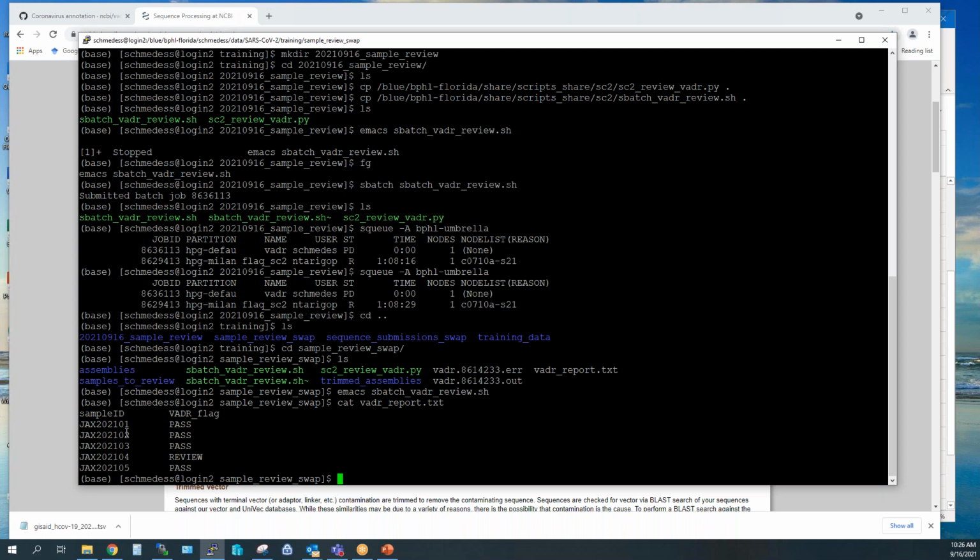So given the results from this script, we can see that, okay, we're going to prioritize these 4, and we're going to go ahead and prepare those for submission and hold off on this one. And when I have time, I'll go back and review to see what that alert is.